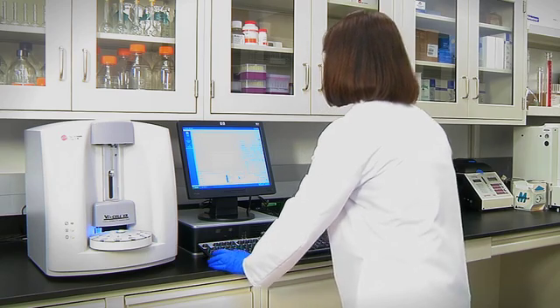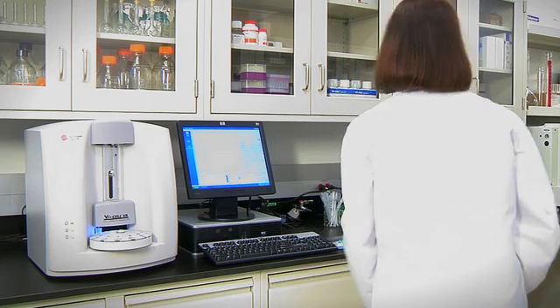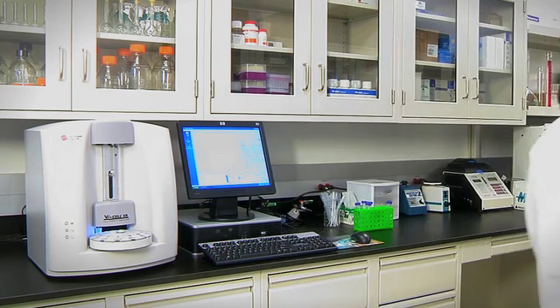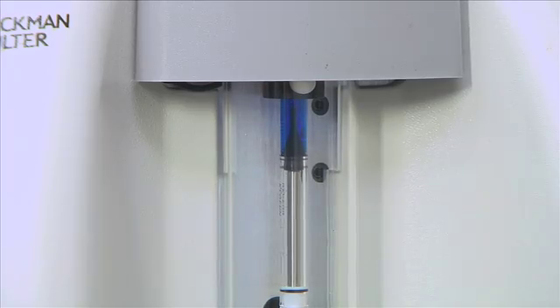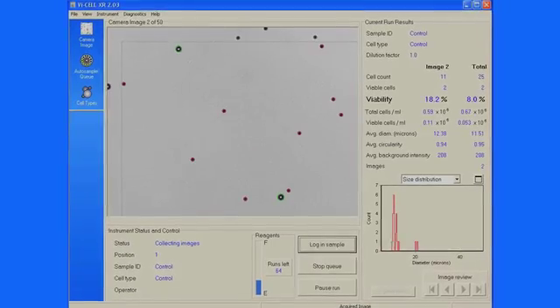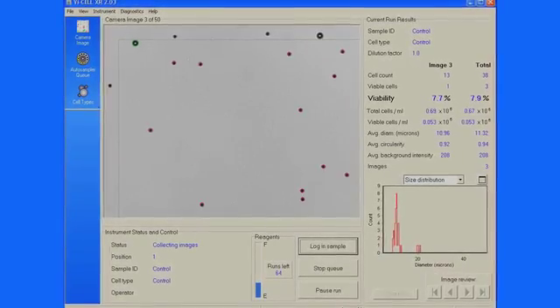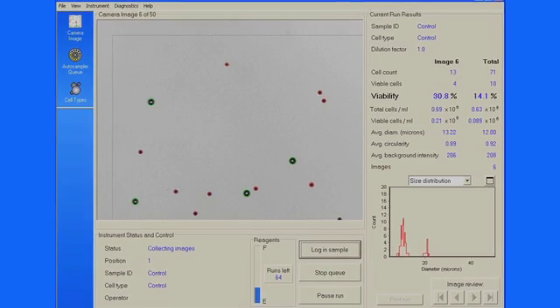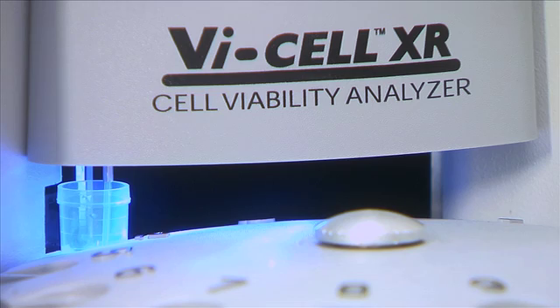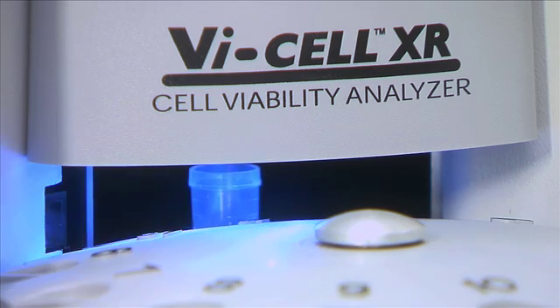In two and a half minutes, the ViCell XR automatically aspirates the sample, mixes it with Trypan Blue, captures the images, performs analysis, generates the results, and self-cleans the fluidics, readying itself for the next sample.